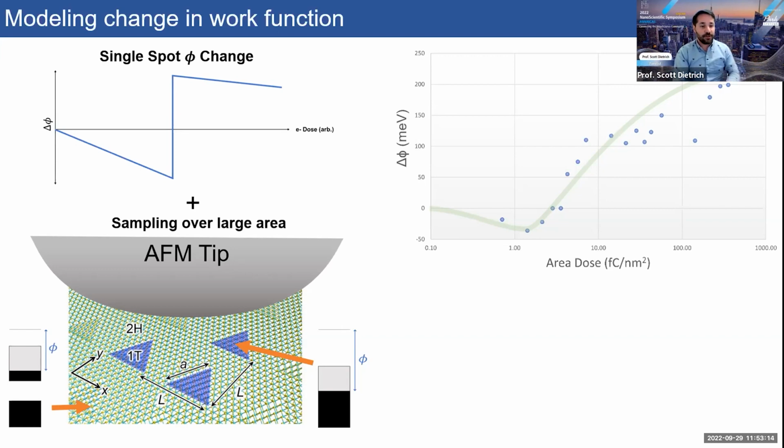But we hope to take this information we've gained from the KPFM and incorporate it and scale down to write smaller features to do quantum wires, quantum dots that we can measure, and incorporate them into larger van der Waals heterostructures for use in gating, and measure the electrical properties as a result.